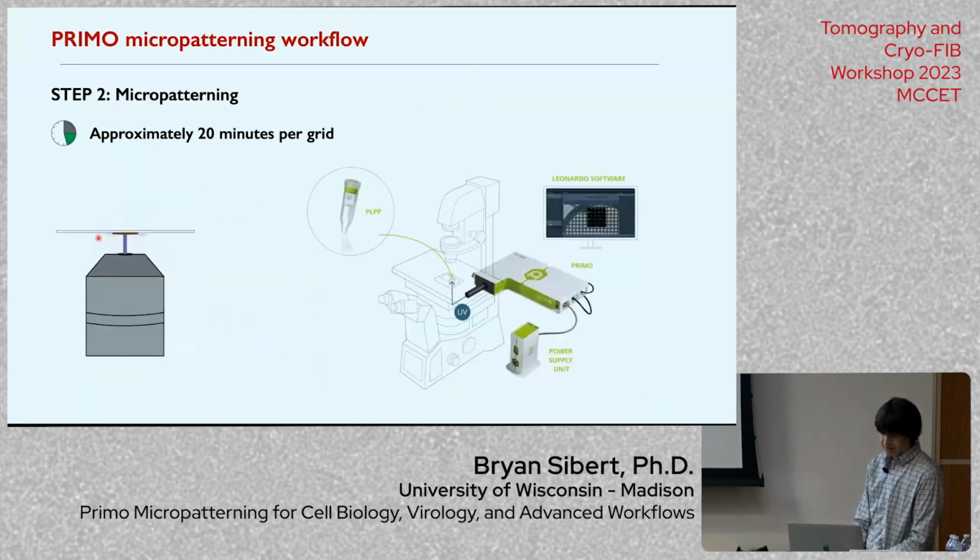And so again, this is all done with the grid facing the objective. So it's hanging upside down off your glass slide. And the PRIMO system is attached to the back of your microscope. And it's basically just a miniature UV movie projector.